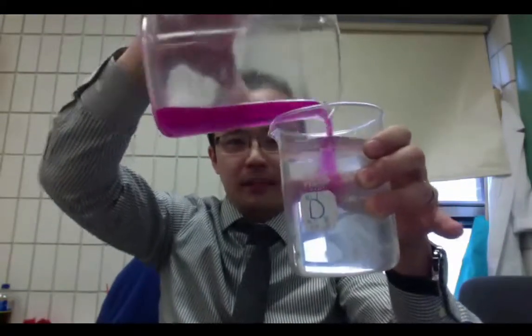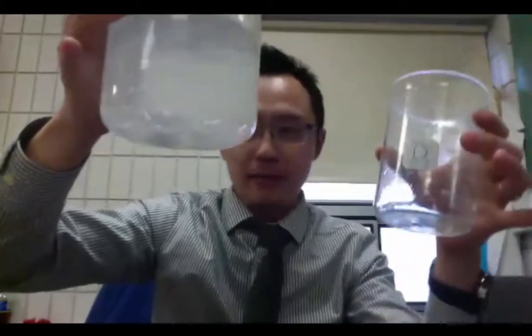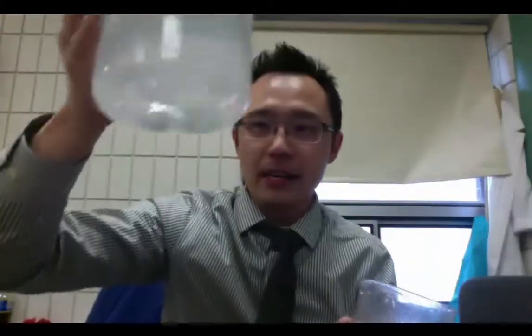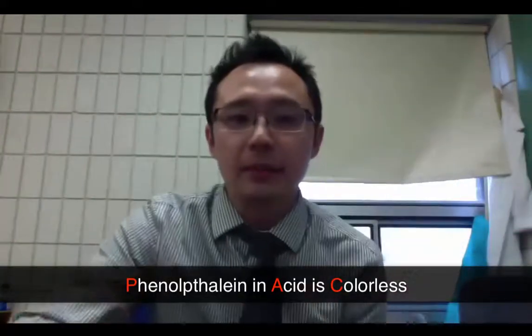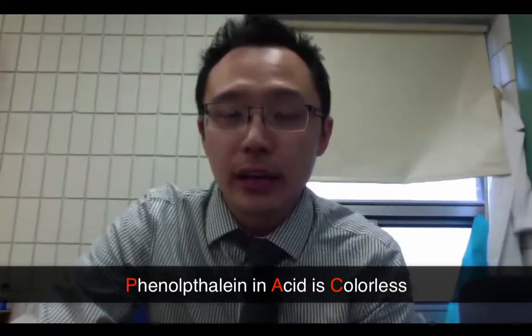But you can see that you can change and play it like magic. I can make this colorless. I can make this pink depending on what indicator I'm using. So that's an example of a phenolphthalein indicator. And it's all dependent on your pH. Like a little seesaw scale. One side is all acidic and then one side is basic. So it's just how much you add to tip the scale. So that's your indicator.